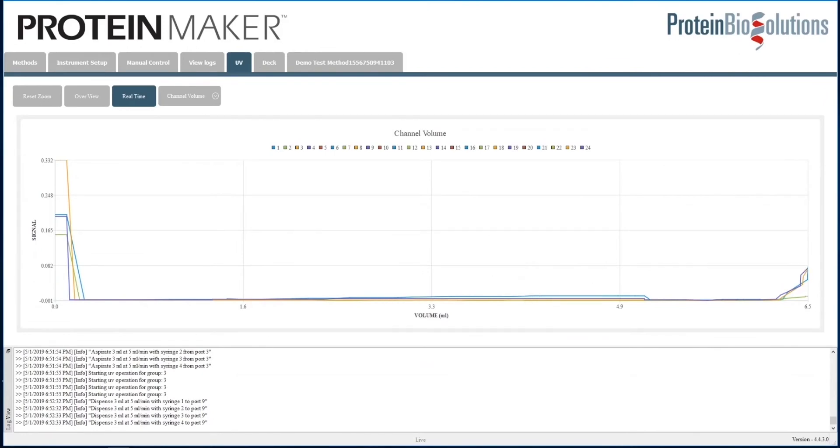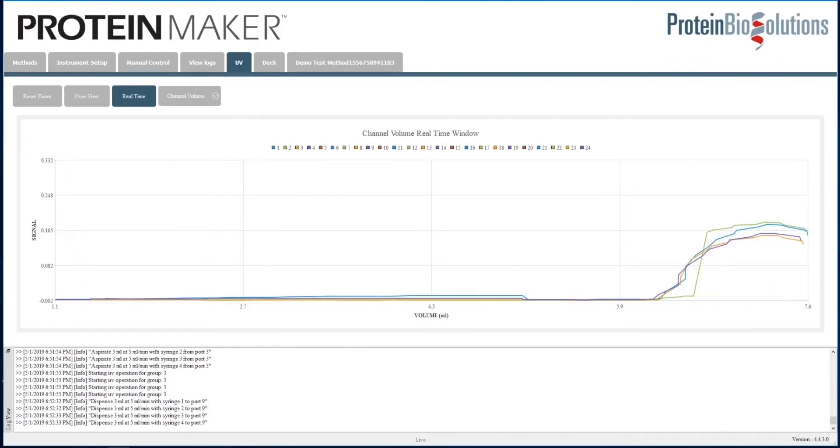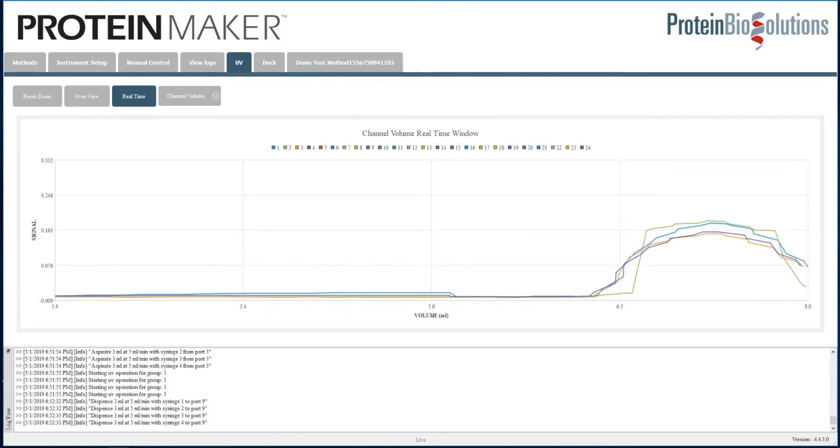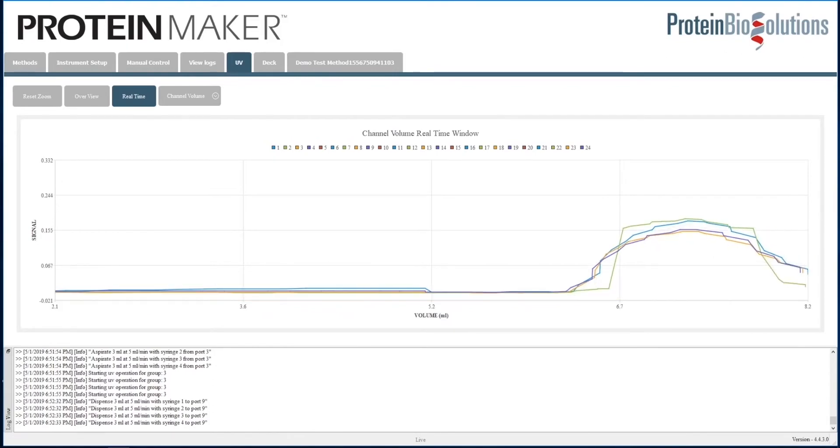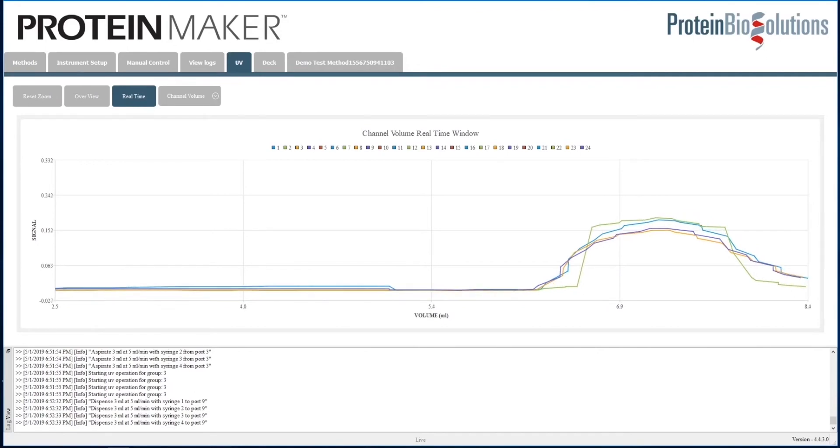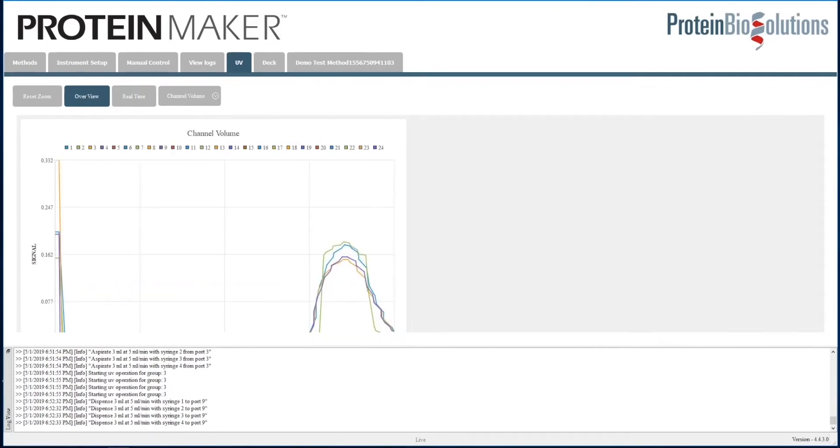If we click over to the UV tab, we can see that we are starting to get an indication that the protein is coming off of the columns and coming through the UV monitors. We have different modes that the UV tab operates in. I've clicked over to the real-time mode, which refreshes every second or so. You can see simple peaks coming out as I move the view to see a bigger picture overview.